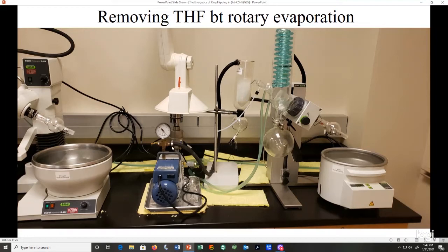and then finally this tube goes down to our vacuum pump. Now the vacuum pump has a valve on it here that's open to the atmosphere, so if I close this valve all the way, I'm creating a near vacuum in this whole system, maybe down to about 1 torr. And if I open this valve up slowly, I can slowly increase the pressure within this closed system.